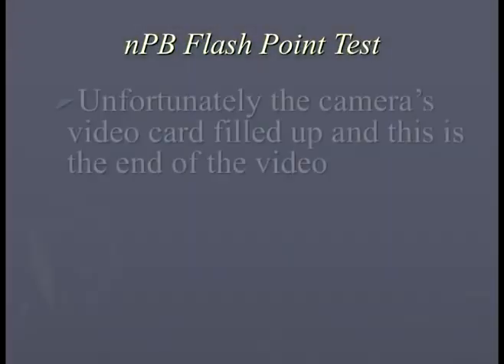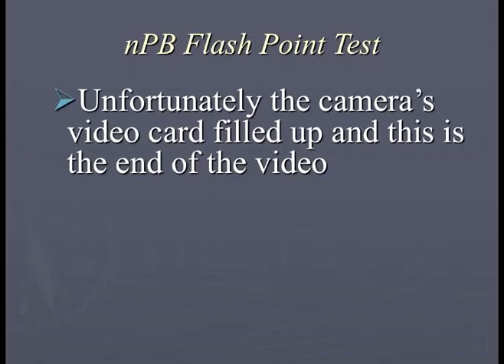Let me kind of level this out a little bit for you. Excuse the jerkiness. Unfortunately, this is the end of the video. The camera's SD card got filled and the video stopped.